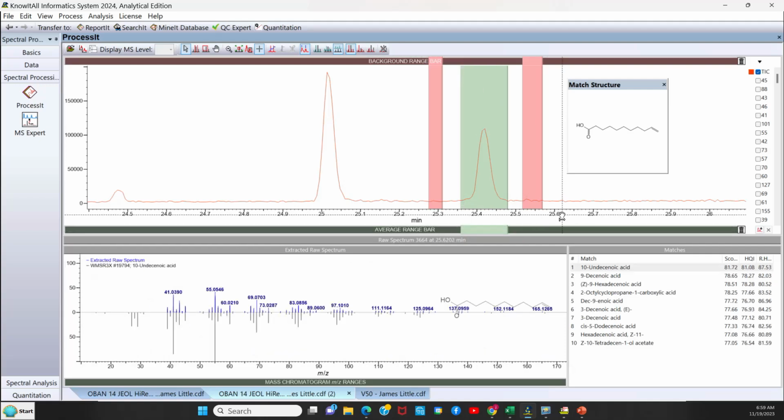Again, it's just doing the searches so fast that it looks like they're done instantaneously, but it's just a very fast search of this 1.3 million compound library that I'm searching, or a collection of libraries. And you can do the same things for your background range up here to move them around or change the range that you use. So it's easy to do these background subtractions, and like I say, in most cases for the big peaks you don't need to do this, but for the smaller peaks it's very good if you're adding something to the library to get a very good quality spectrum to do a manual background subtraction.